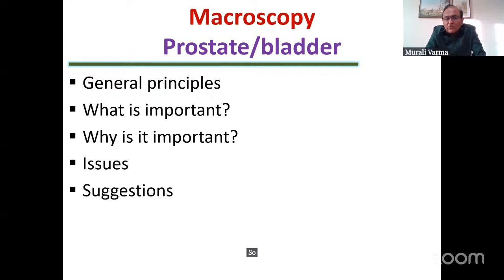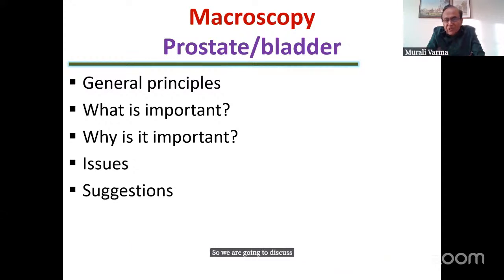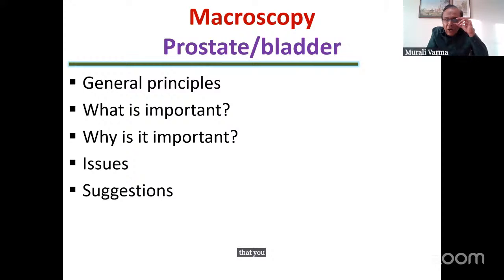So what am I going to talk about today? This is not a how-to session, okay? I'm not going to tell you how to gross a prostate or how to gross a bladder. We are going to discuss more in terms of the general principles, what is important, why is it important, certain issues, not the obvious steps in grossing, and then I'm going to give you some suggestions. Take it or leave it. As usual, I give you my opinion. That doesn't mean that you have to accept it. All I ask is that you do consider it.